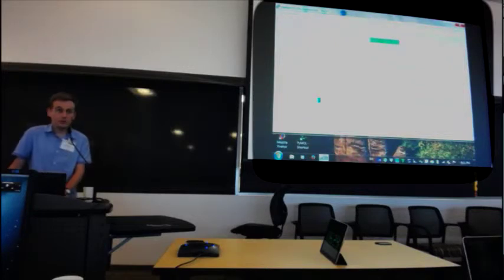So now to go from CrystFEL format to, for example, XDS format, we are going to use the create xscale script, which is also here in the scripts directory. Let's have a look what's inside. It's a script that converts the HKL files and adds this header.